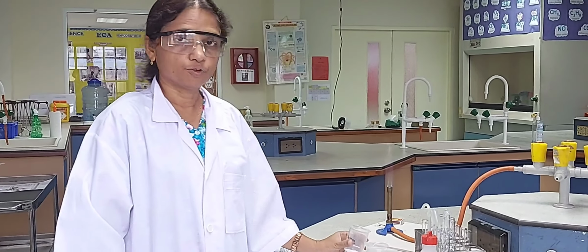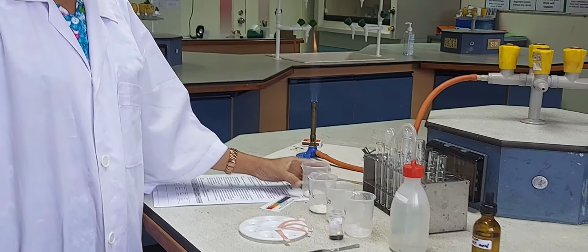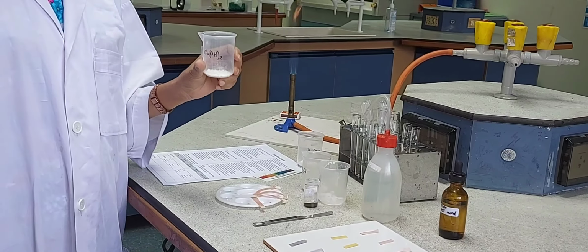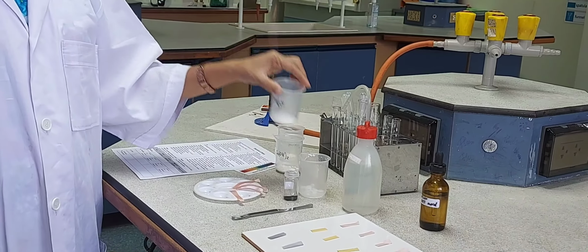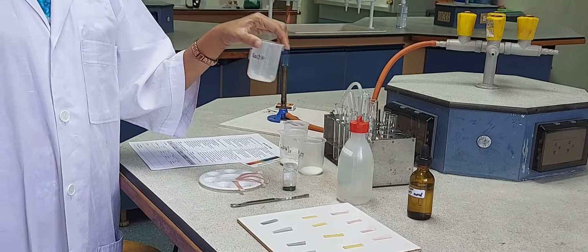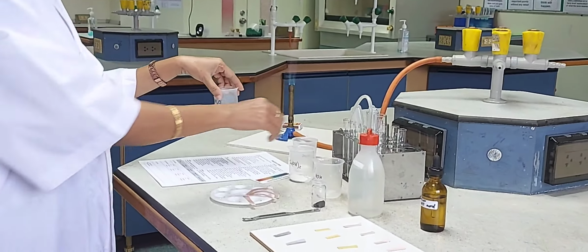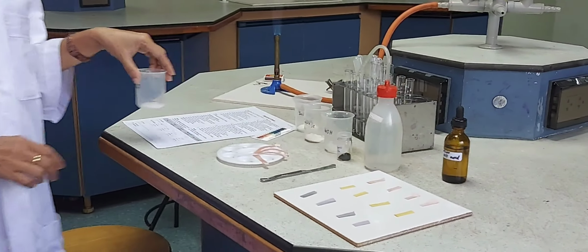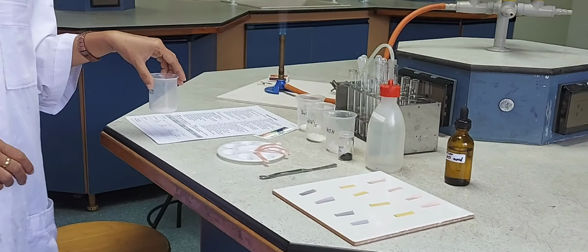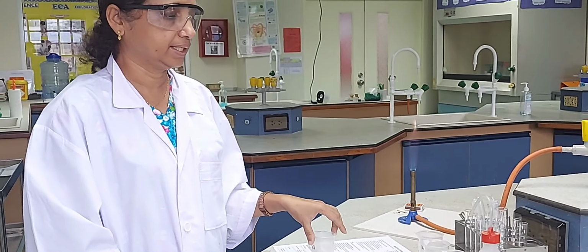So I am given 4 bases. One is barium hydroxide, the other is calcium hydroxide, then ammonium chloride, sodium hydroxide and copper oxide. Now ammonium chloride is a salt of ammonia, so that cannot be taken as a base. So we have 4 bases: copper oxide, sodium hydroxide, calcium hydroxide and barium hydroxide.